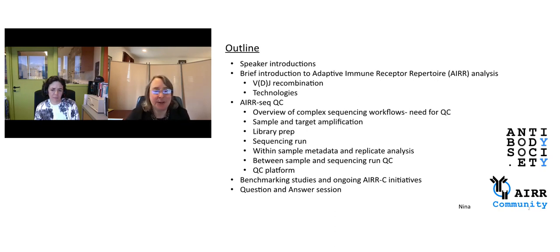Then we're going to do a pretty deep dive into various aspects of quality control of immune repertoire profiling, and maybe share with you some of what I like to call our dirty laundry, just how things can go wrong, and there's a lot of different ways things can go wrong. So we'll take the whole experiment apart and look at it step by step.